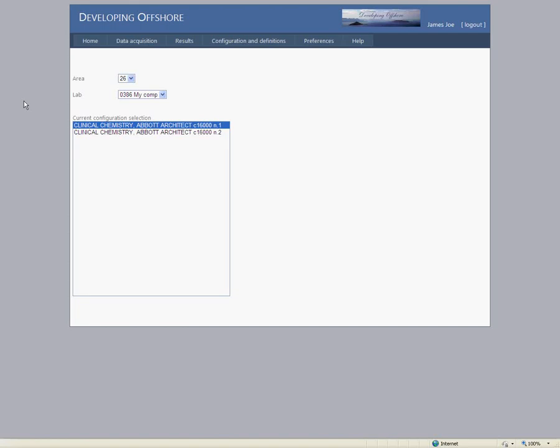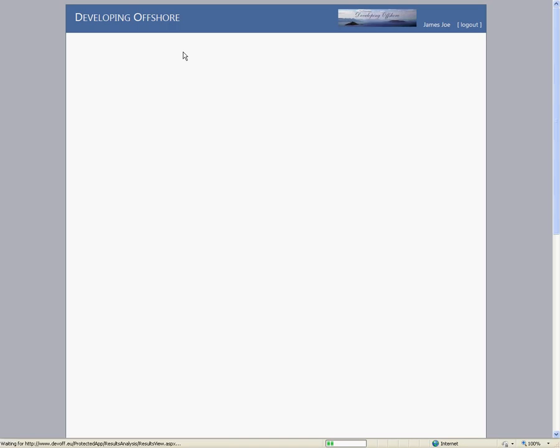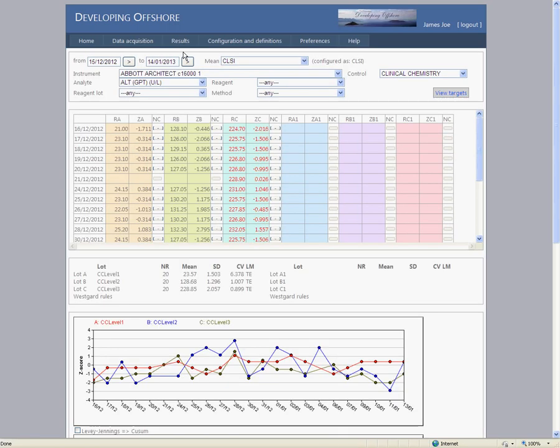In this video, we will learn how to view and analyze your results. Let's go to Results, Search View Results. This is your main tool. So first, let's define a period with from to date.